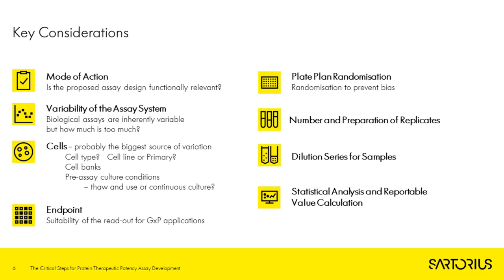So if we want a real assessment of our sample variability, which is important when we look at our statistical analysis, we need to prepare each dilution individually. So for 3 replicates, we would have 3 independent dilutions from the test sample itself. The difficulty with pseudo replicates, which is the same dilution, can be that we could produce data that is artificially precise and therefore potentially fail our system suitability criteria for a sample or the standard, which would ultimately lead to a failed run.